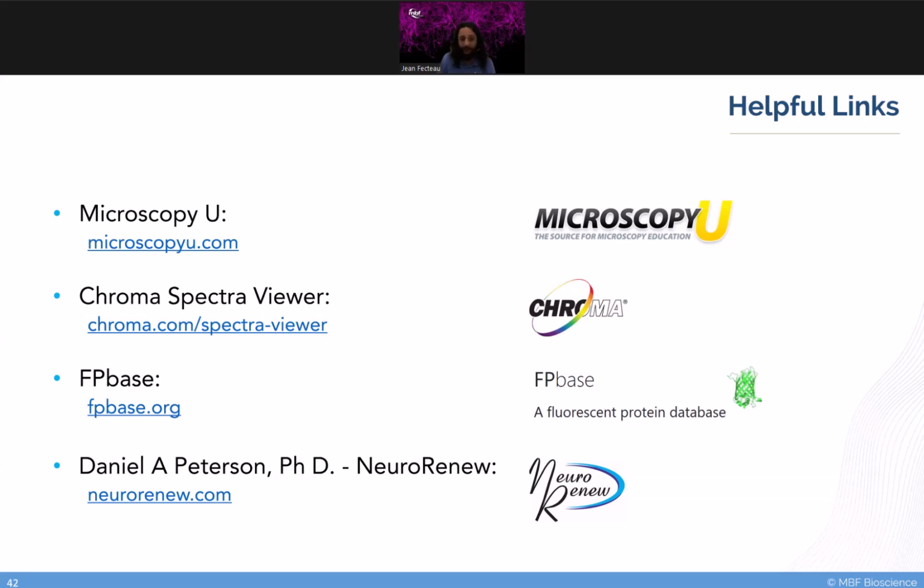But if you want to learn more about any of these in depth, I can recommend a few different resources for you. The first is Microscopy U, which goes through a lot of introductions to many of the things that we're talking about here. It also takes some deep dives into the microscope hardware itself and what its capabilities are. Next, we have Chroma's SpectraViewer.